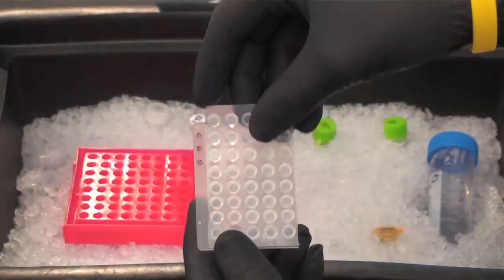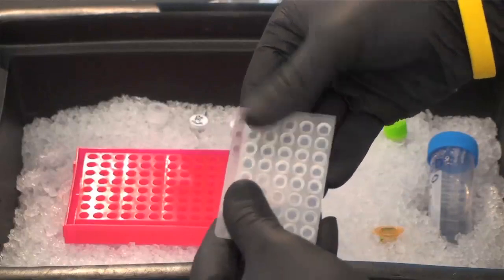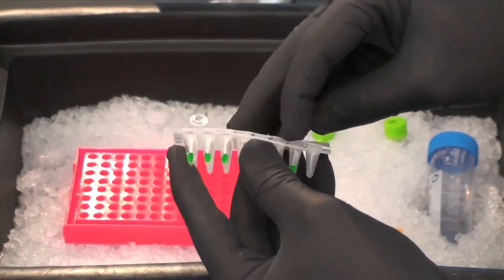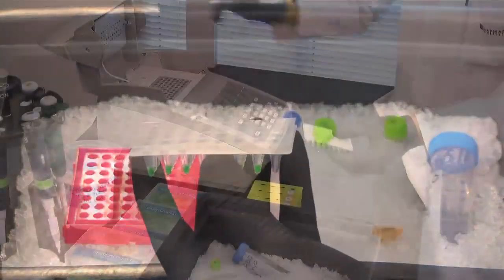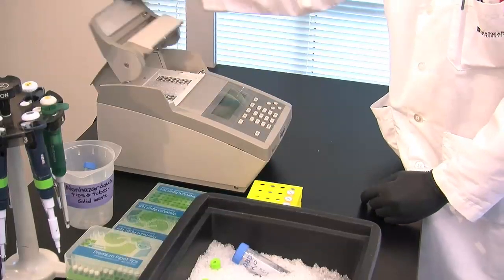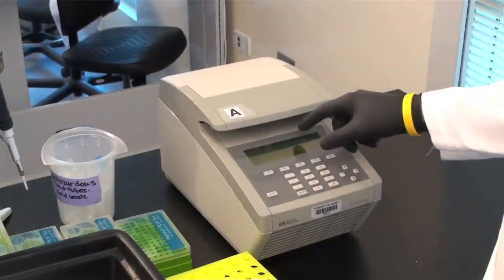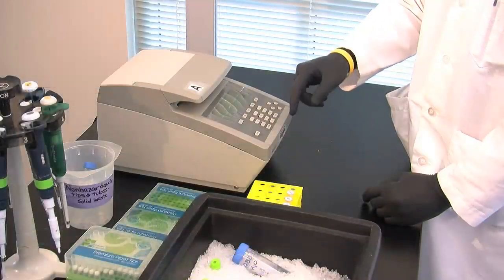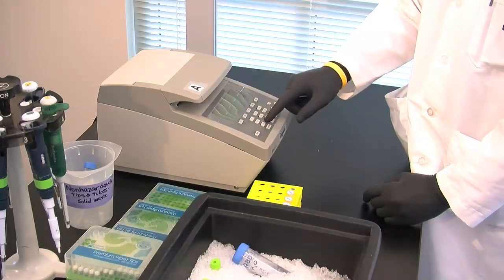Seal it with a cover and press it down. Put the samples in the PCR machine and close the lid tightly. Select the program you're going to use and start it. Each well contains 25 microliters, so press 25 microliters, then Run.